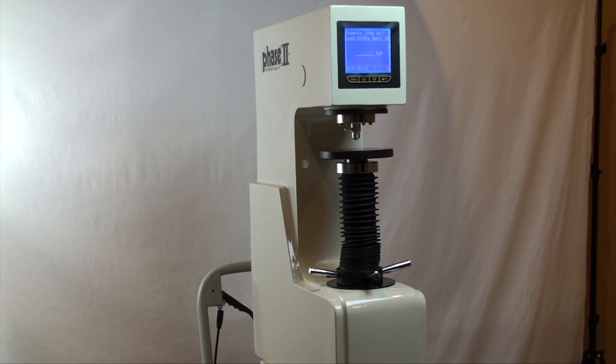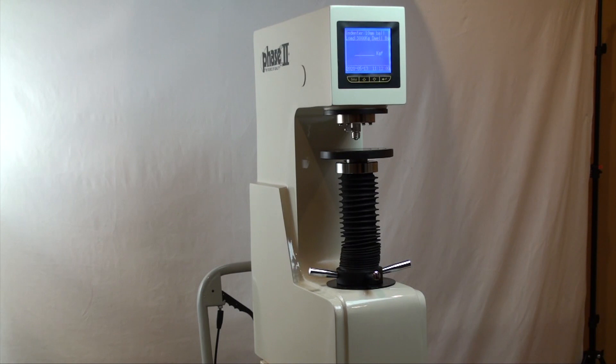Now let's move over to the operation of the Hardness Tester and see how easy it is to utilize the different functions, taking tests and obtaining results.